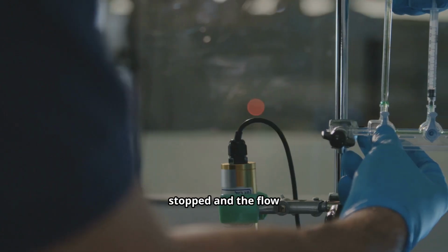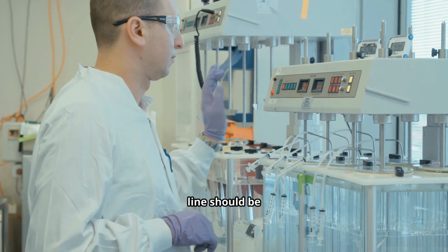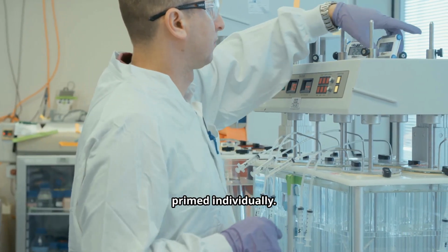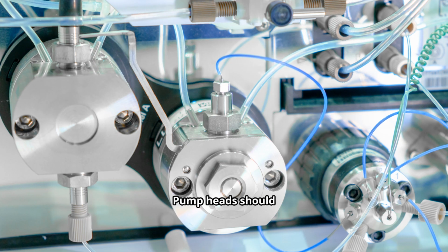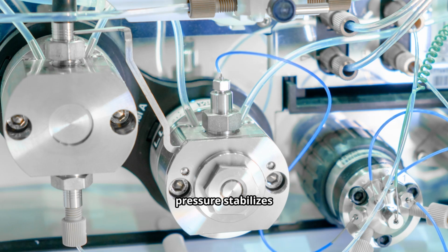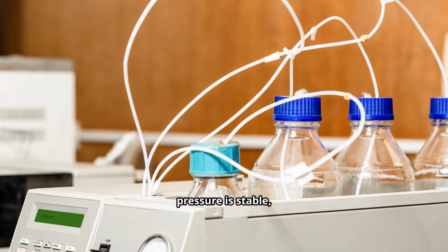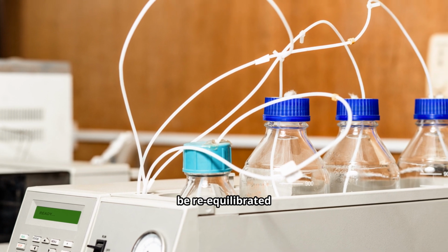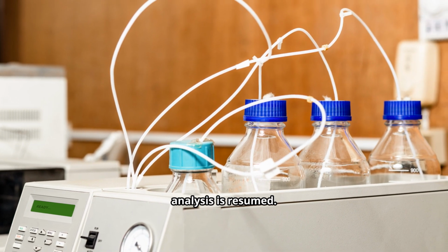The run should be stopped and the flow rate reduced. The purge valve should be opened, and each solvent line should be primed individually. Inlet frits should be inspected and replaced if restricted. Pump heads should then be primed according to the instrument's procedure until the pressure stabilizes without oscillation. Once the system pressure is stable, the column should be re-equilibrated with fresh mobile phase before analysis is resumed.